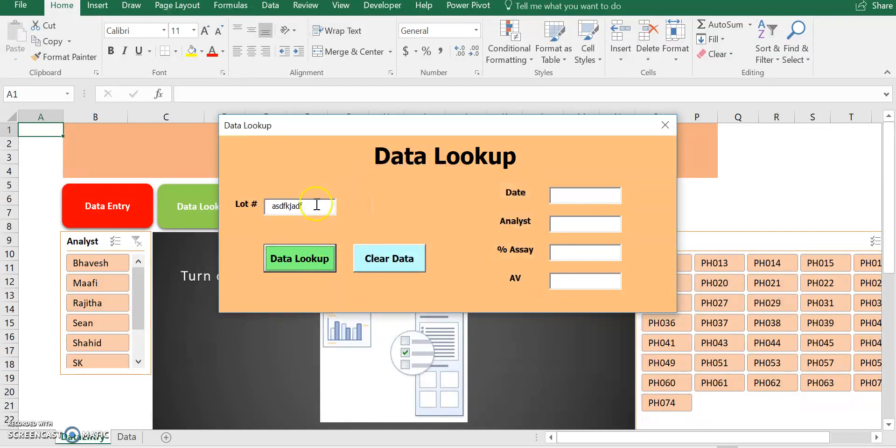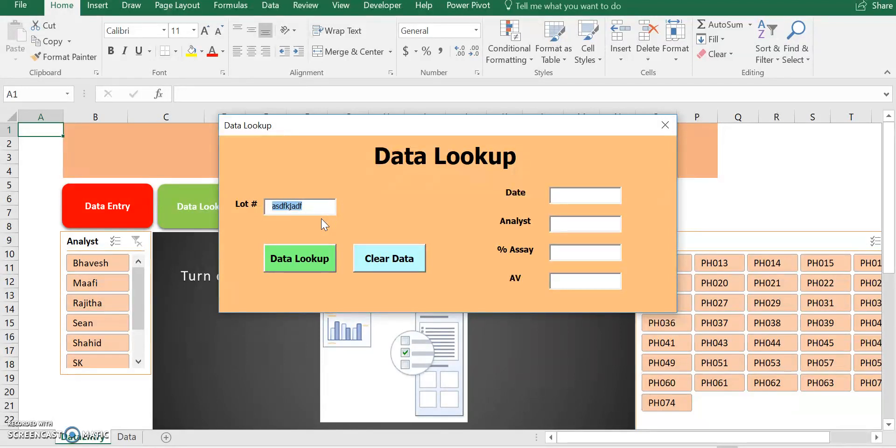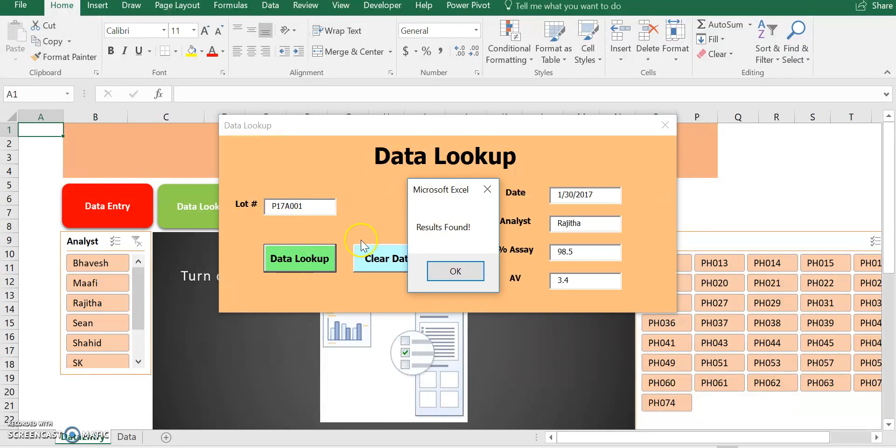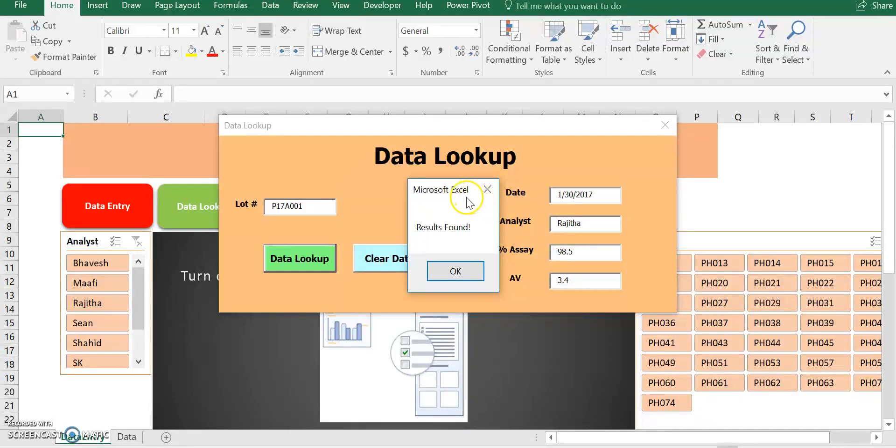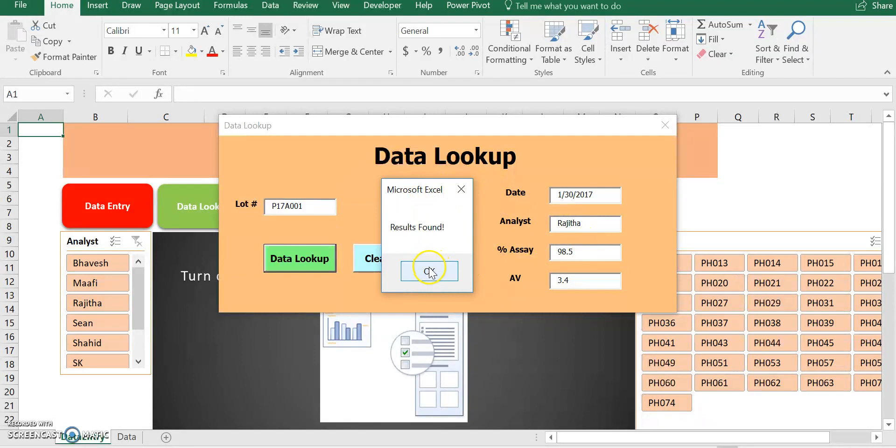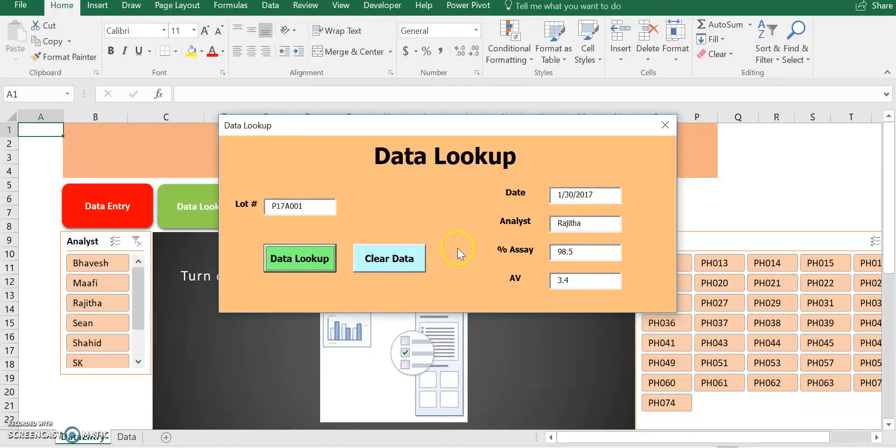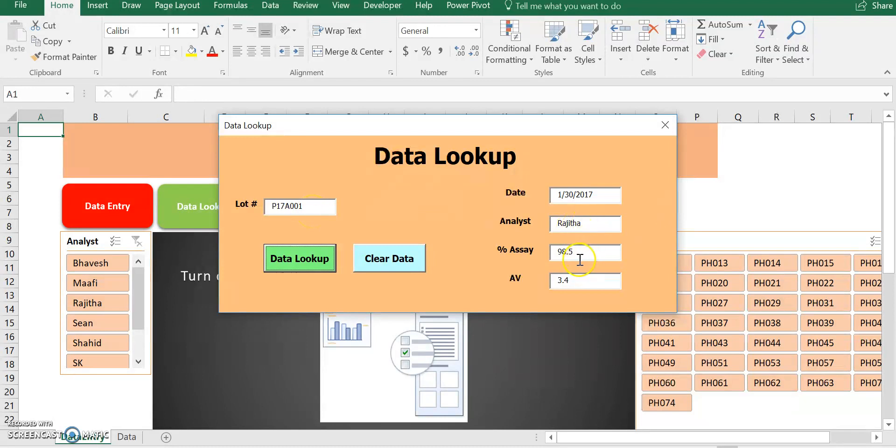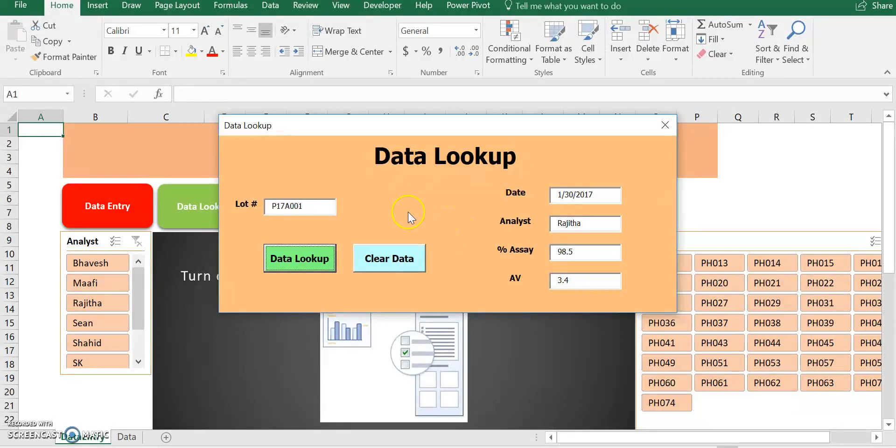So let's actually try one product that's actually in the system. I'm going to say, I think it was P17A001, right? So I'm going to look up data. As you can see, results found. So the date is pulled, the analyst is pulled, and the percent assay is pulled. Let's see if it's correct. Remember, it's P17A001, I believe it's the first sample in our database. Regida 98.5, let's see if it's correct. I should have put a go to database button here, but I forgot. It's okay, it's easy to do.